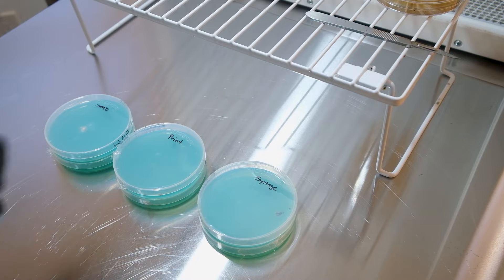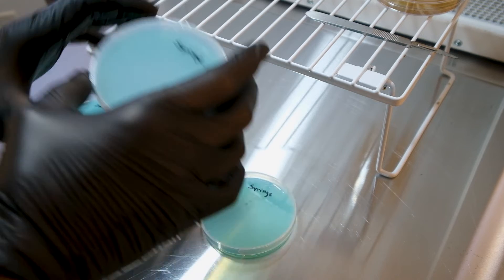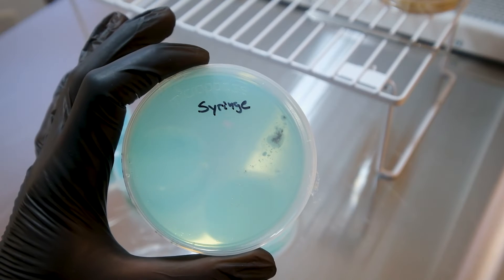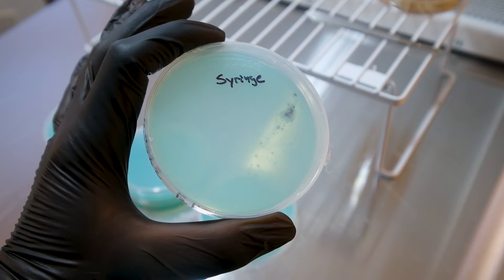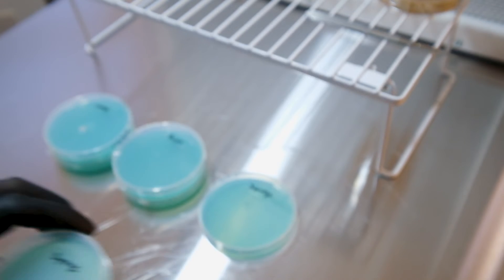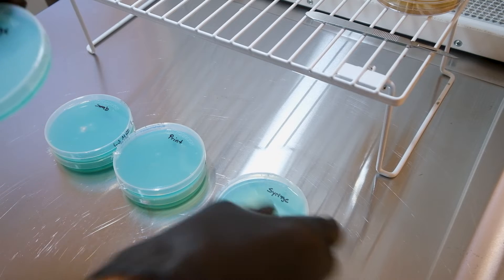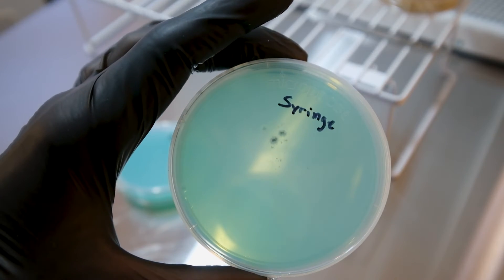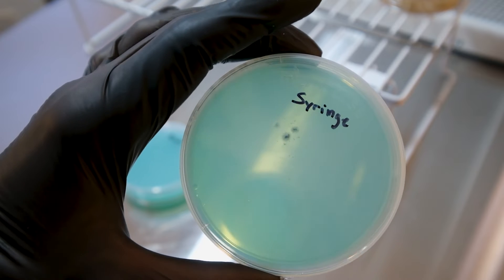Let's take a look at the syringe plates. As you can see, this is where we got that big glob — you've got some mycelium starting to grow off of those right there, so that one's germinating nicely. Syringe plate number two — you've got some germination of mycelium there too.